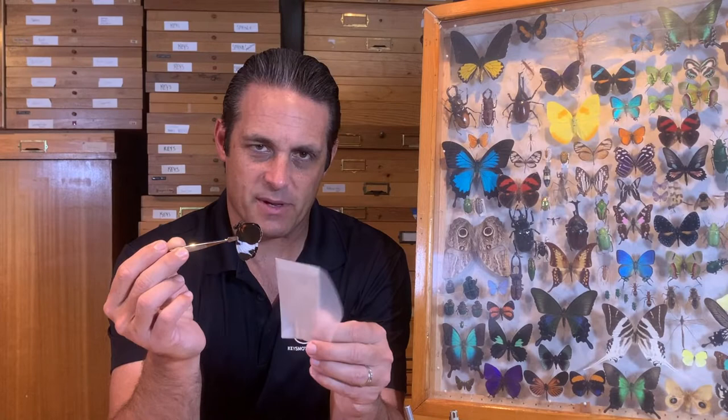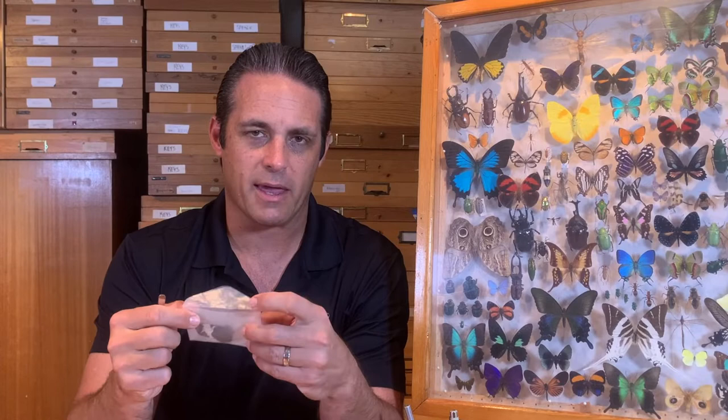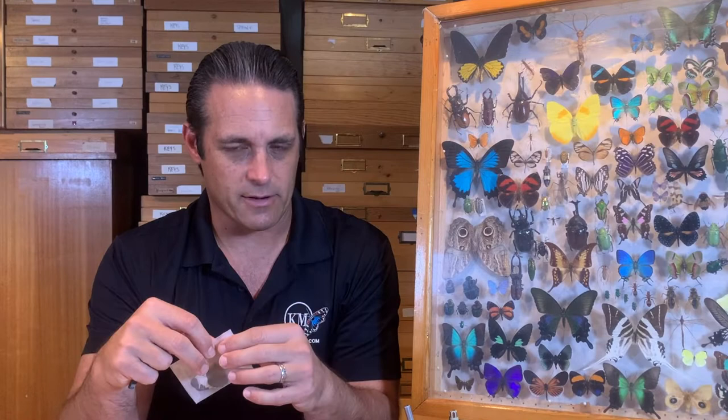The glassine envelope does not remove scales. Whereas if you were to make a paper envelope, the paper is very fibrous and as the specimen rubs against the paper, the scales will come off and you'll see them floating around. When you open up your envelope, dust and butterfly scales come out. No bueno.